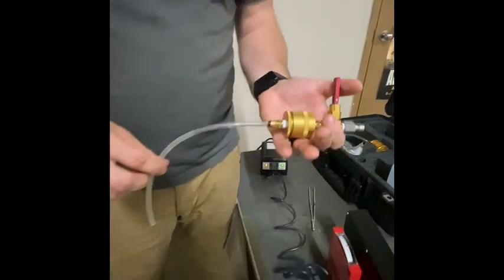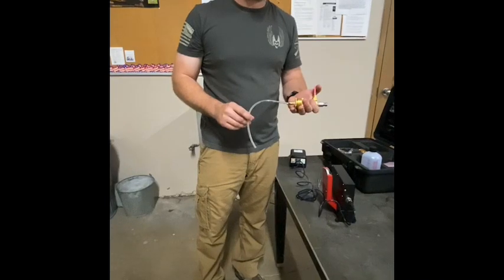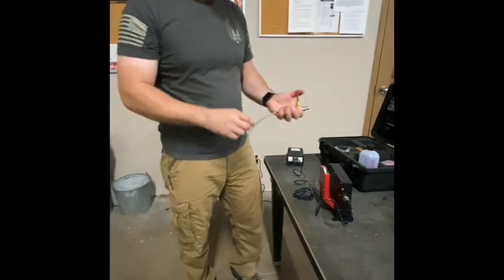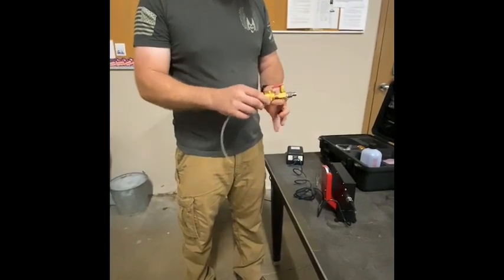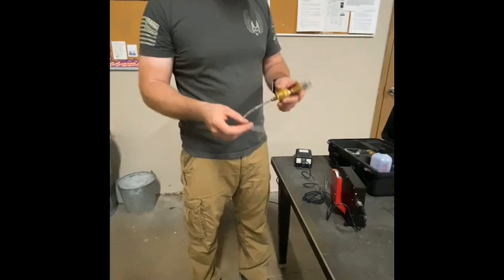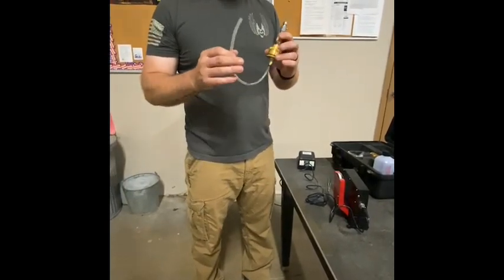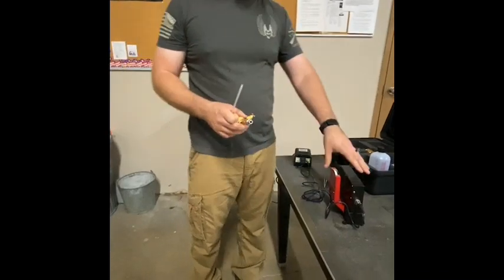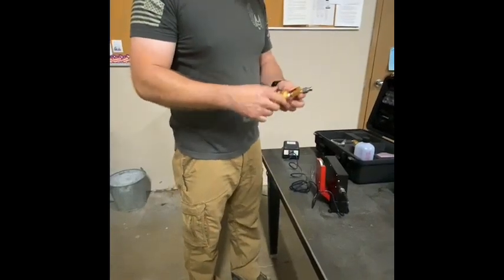Now for the testing process, you will flush 500 milliliters through that test pad. Once you have your 500 milliliters, close it and don't open it yet. You would take this so that there's no contamination from humidity or whatever else. Take this to wherever you have your testing device. So then you would take out your pad.